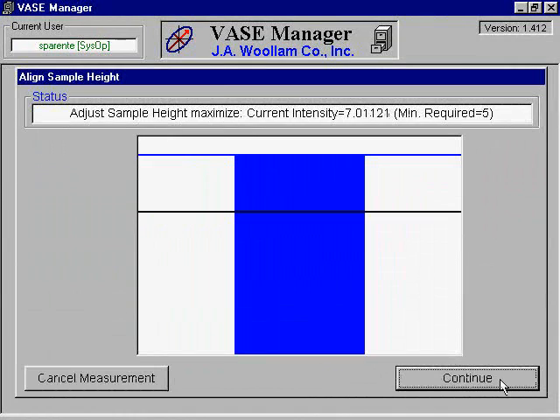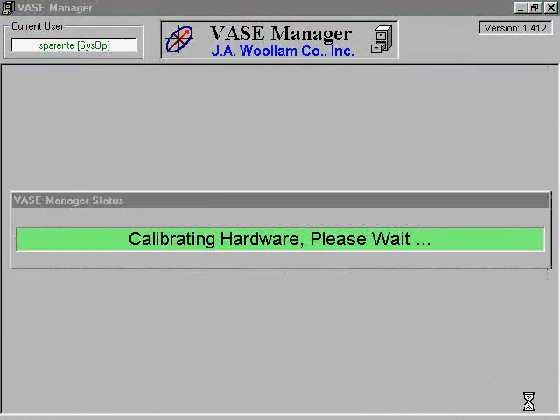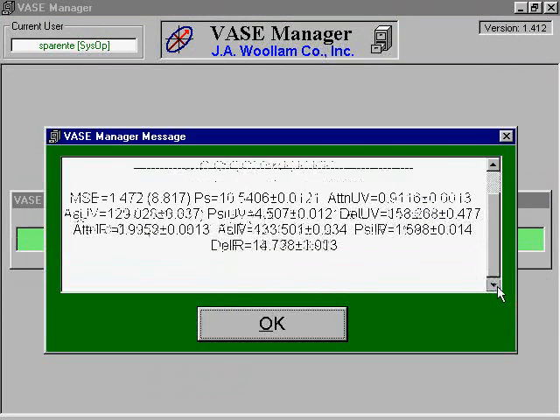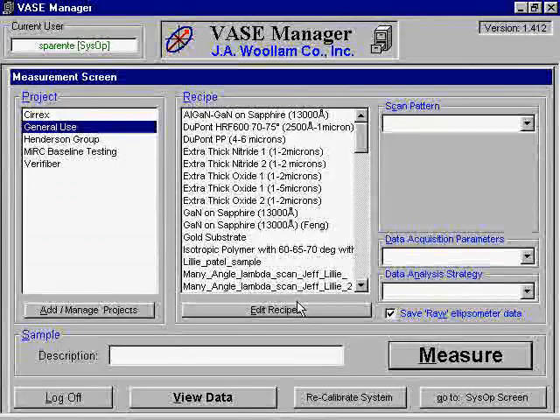After adjusting the height of the stage, the ellipsometer will begin the scan. The calibration usually takes about 10 minutes. Afterwards, a summary of the calibration data will be shown. Make sure the MSE is reasonably low, otherwise the calibration needs to be performed again. Click OK and begin your own scan. This should complete the process of calibration.